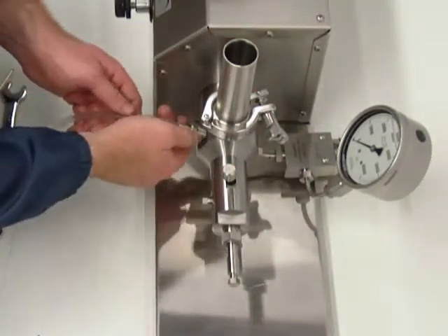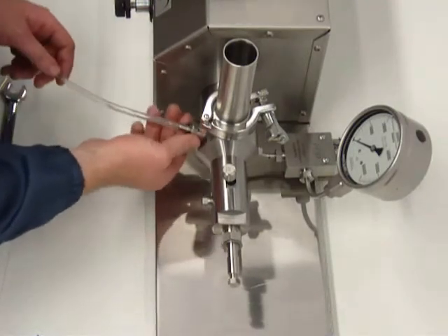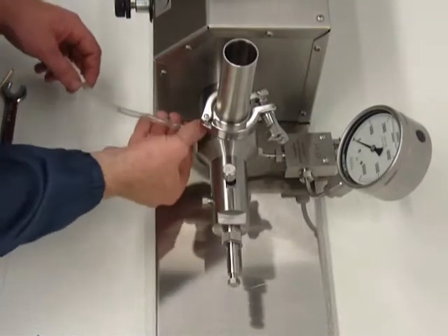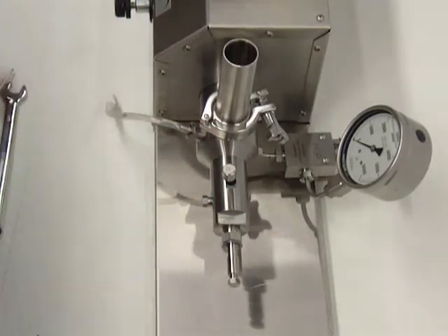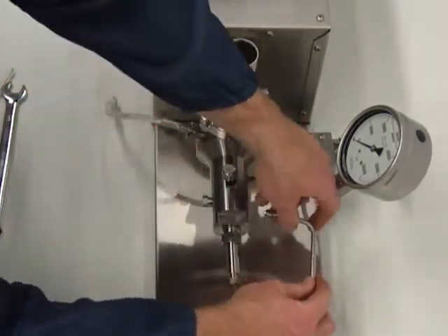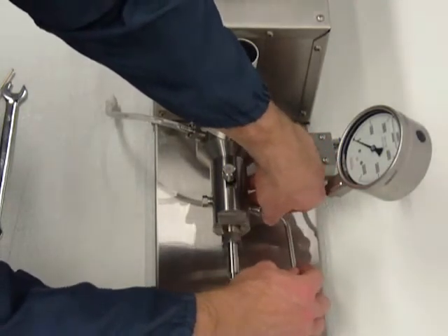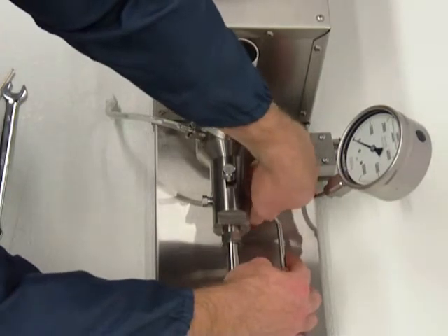Next is the priming valve. Let me just hand tighten for now since he'll be priming before operating the machine. Finally, the product outlet tube. You want to check the nipple and the collar, then install into the high-pressure cylinder.